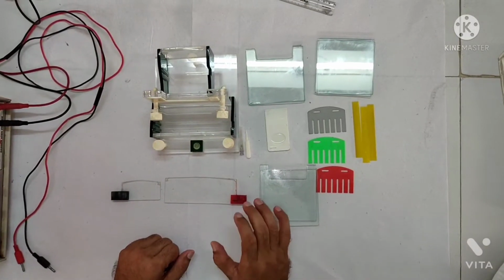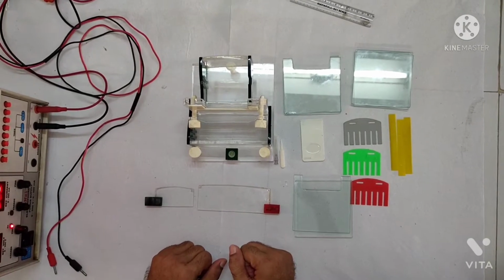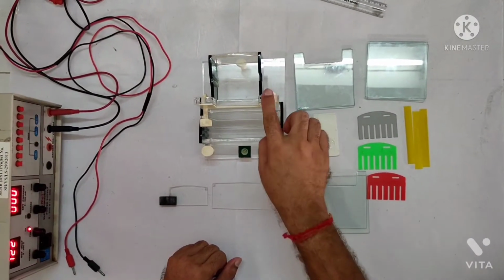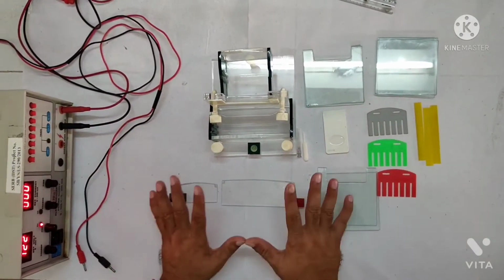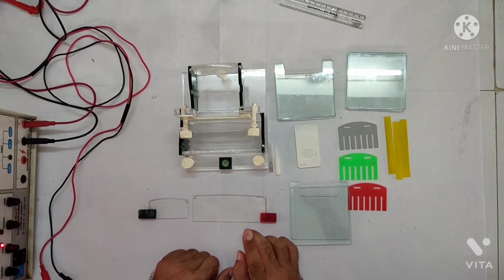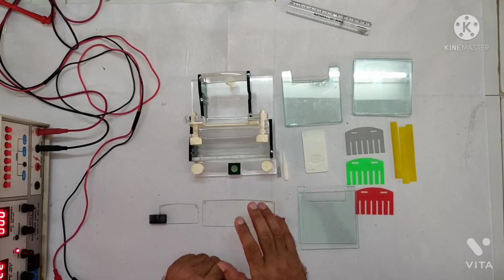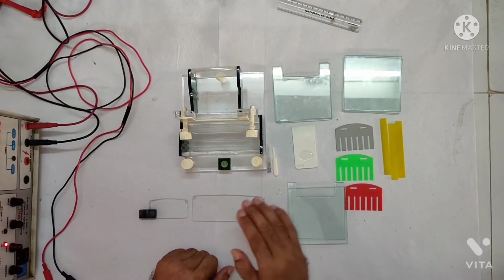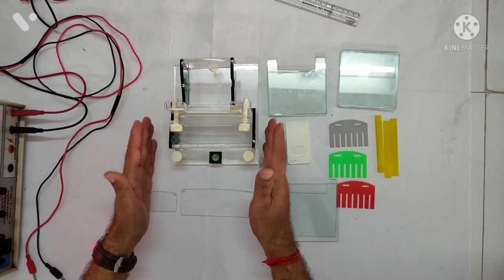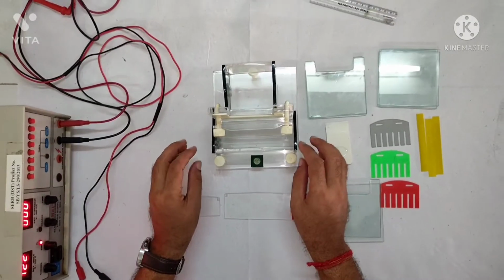So good morning friends. Today we try to understand how the vertical gel electrophoresis will work. This is the vertical gel electrophoresis instrumentation, okay? And this gel electrophoresis is mainly used to separate a mixture of proteins. If you have different proteins with different molecular weights and you try to separate them, then you can use this gel electrophoresis. This is a very small and very simple unit of gel electrophoresis.